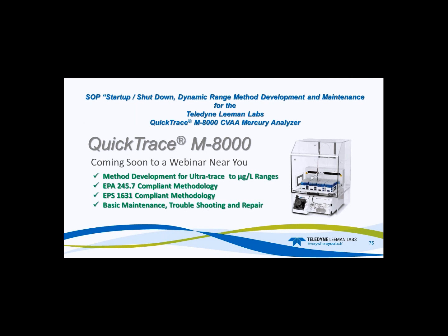So I'm going to tease you a little bit. Coming up, I will have another webinar here shortly, and that will entail startup, shutdown, dynamic ranges, and how do I actually develop those with real data. And so method development for ultratrace to microgram per liter, and I will talk about 1631 and 245.7 method compliance and how that works within the software. And then I will move into some of the basic maintenance, troubleshooting, and repair.